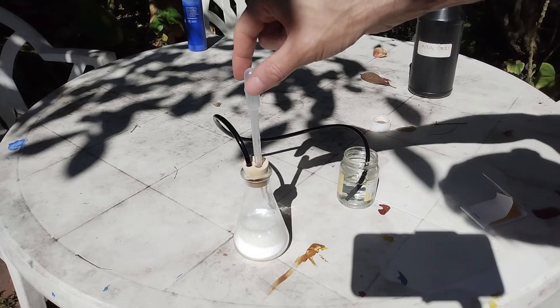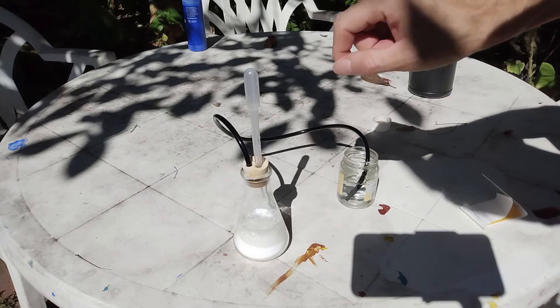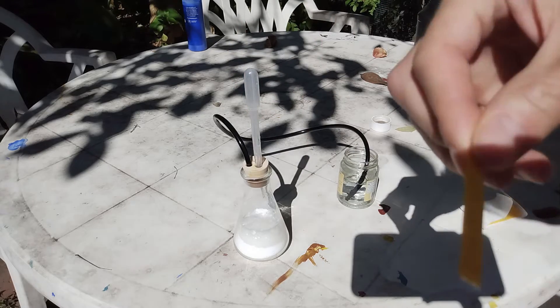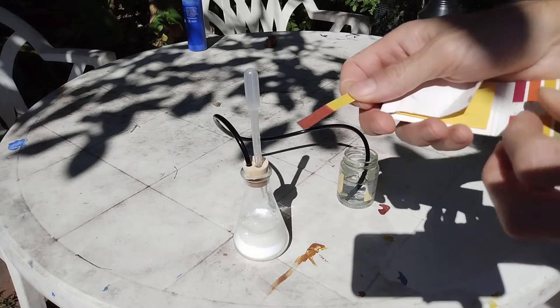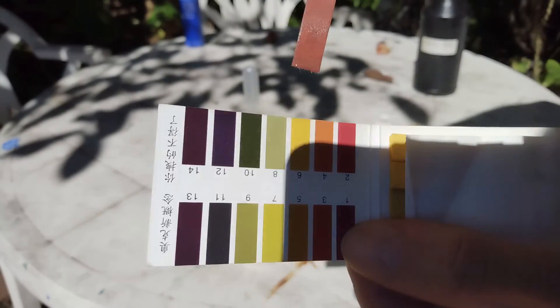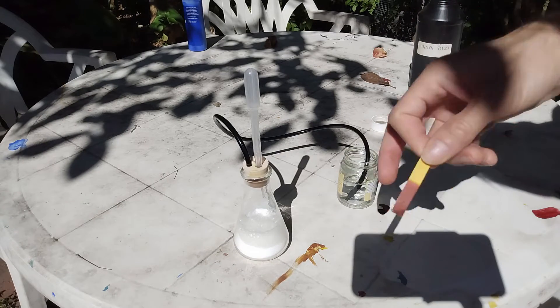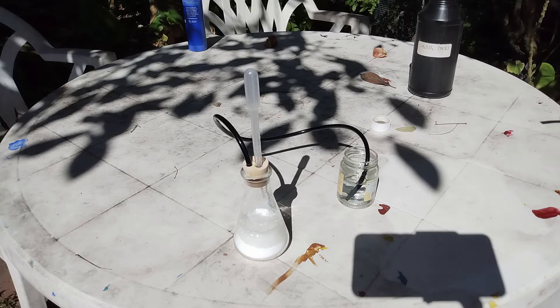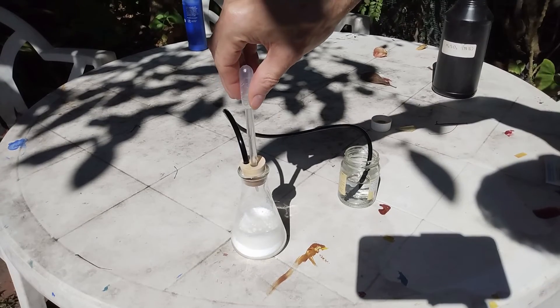I just emptied my second pipette of sulfuric acid into the flask. It's still bubbling, but let's take the pH. Now it turns red and we have a pH of about two. So let's keep adding some sulfuric acid. Third pipette.